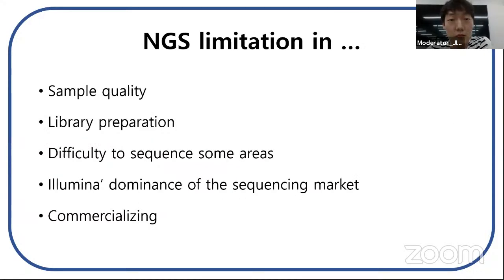Although there is a desire to use NGS in clinical applications such as microbiome therapeutics, significant limitations currently exist. These limitations include sample quality, library preparation, difficulty sequencing some areas, and Illumina's dominance and commercialization.